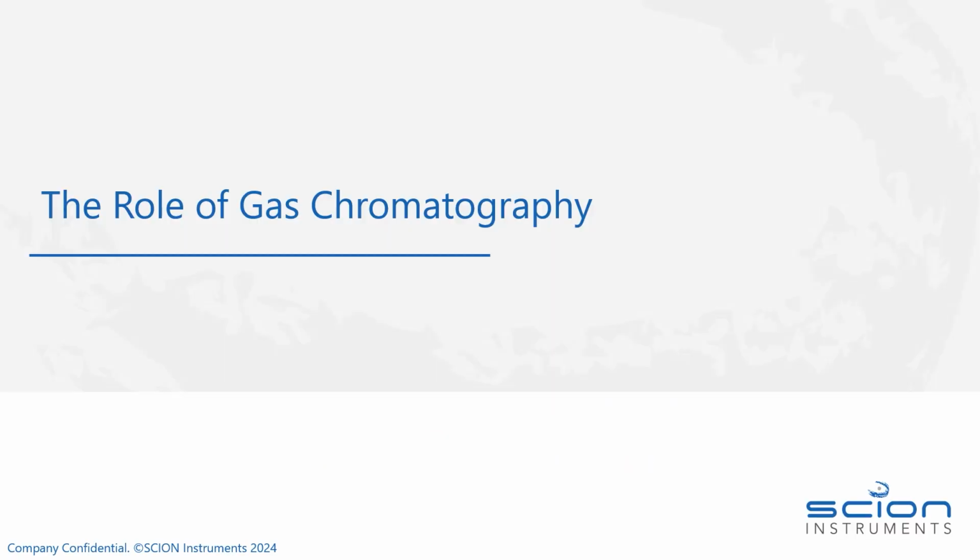So if you're all still awake and still with me, we'll move on from regulations and start to discuss the role that gas chromatography can play in this testing for this regulation.